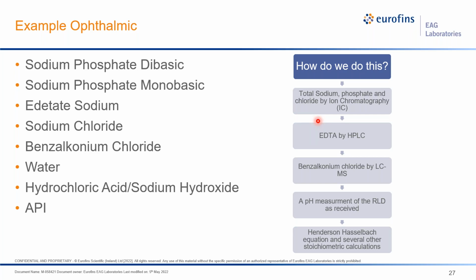One thing you'll notice I didn't mention is the water in the API. So the water, again, Karl Fischer, it's going to be 99%. Sometimes we don't even have to measure it because we know it's going to be the rest of the formulation, right? So we do every other measurement. Maybe we get 0.8%. We know 99.2 is the water. We sometimes do it. We sometimes don't. Really just depends on what we're looking to do.